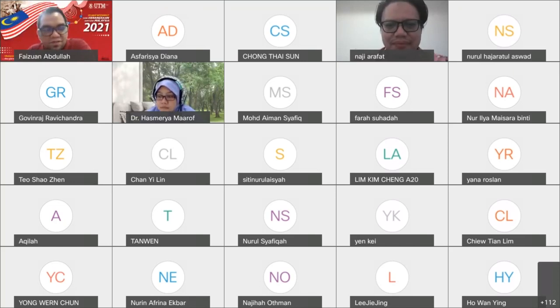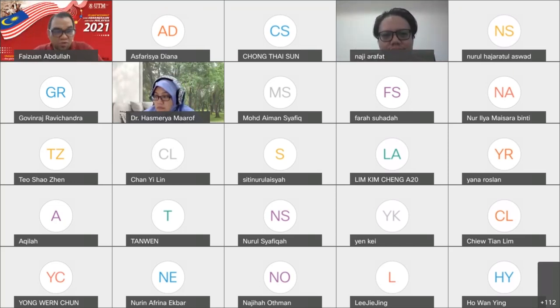It is not difficult. Just sit on your chair, right? Watch, and then answer the question that we ask you, right? And we hope that this can at least replace 80% of the real lab session, right? You can watch the video and you can ask us a question. We can ask you to ensure that you understand the process and so on. We also include the lab safety question inside this session, to let you know what precaution steps you need to take during the lab session, because the lab is the most dangerous place in your studying process, especially the chemistry lab. We have all types of hazards there.